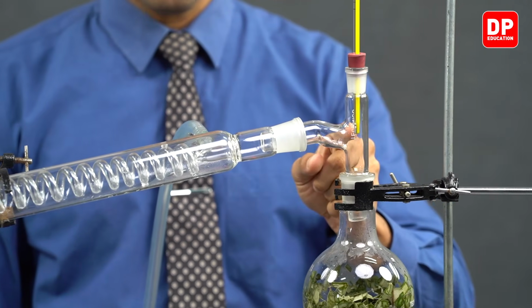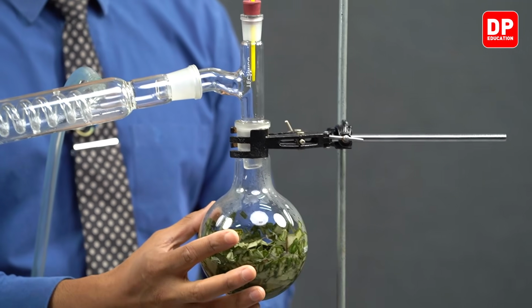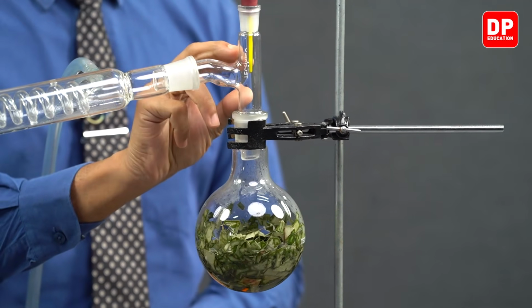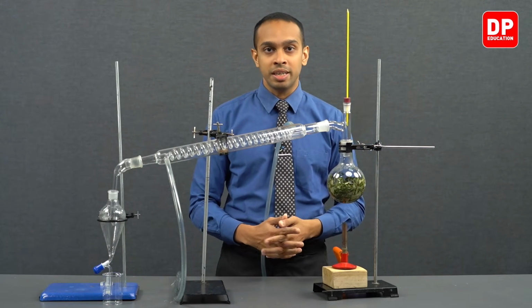So when we have the thermometer fixed in such a way, when steam is produced, we can actually measure the temperature of the steam plus the essential oil mixture by reading the thermometer reading here.